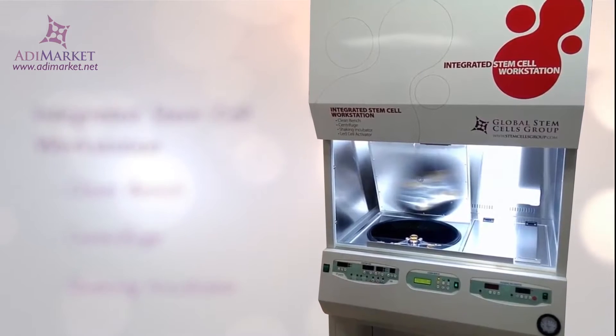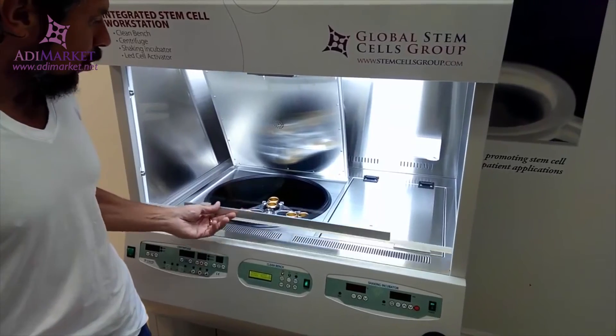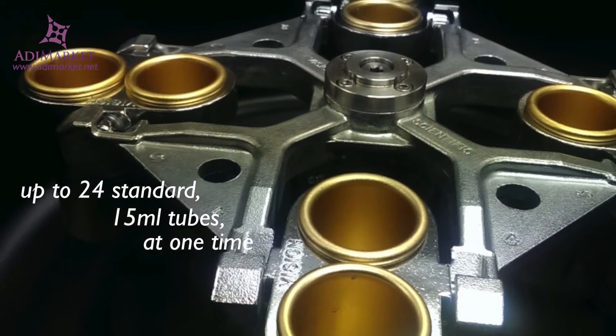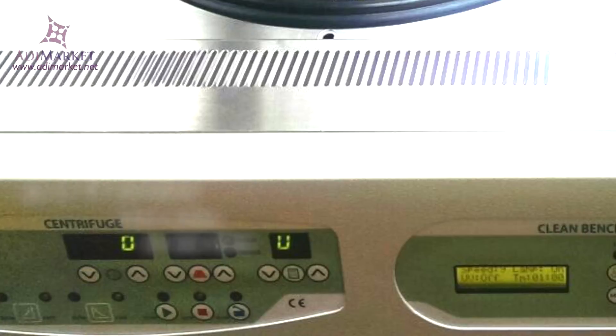A clean bench and a wide work table give you plenty of room to perform a multitude of activities, everything from isolating cells to handling and working with blood. Work with up to 24 standard 15 milliliter tubes at one time in the general and cooling centrifuges. After centrifugation, use the cell station's shaking incubator to mix or incubate your samples.